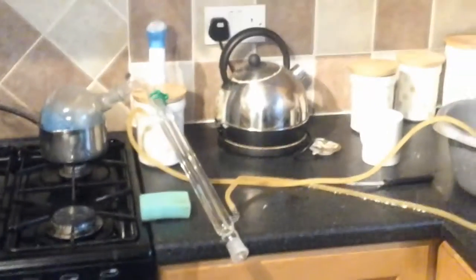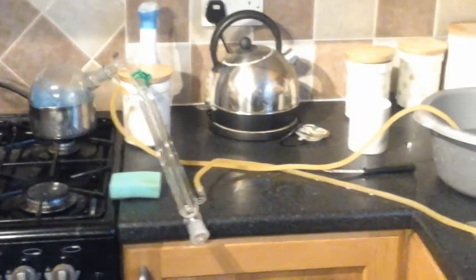So that is how not to do distillation in your kitchen — and I fancy a cuppa.